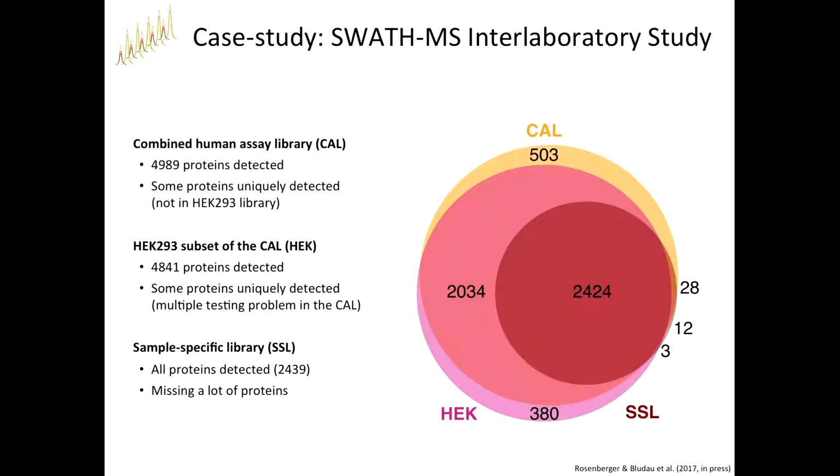So the scaling that you have to do, or that you are allowed to do, is much larger, so you can shift your FDR threshold to the right, as Mike and Ludovic have already pointed out. And the last library is the sample-specific one, and here you can see, well, you're doing great in terms of you identified 100% of the library, but in general, you are missing quite a lot of the proteins because they were just not present in your library.